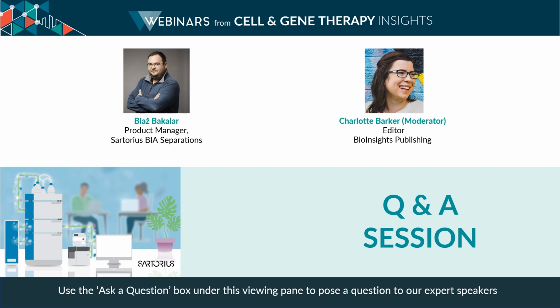Brilliant, thank you. And does PATfix have MALs? Yes, actually it comes with MALs, and this is also something that we're developing as an analytical tool to also help further characterize LNP particles, not just encapsulation and efficiency.